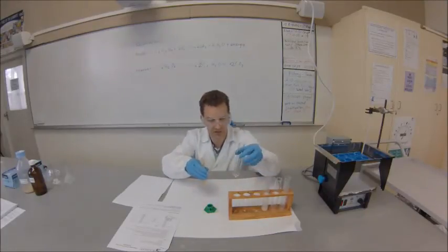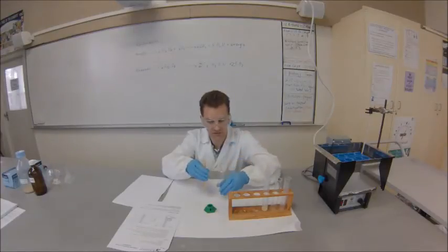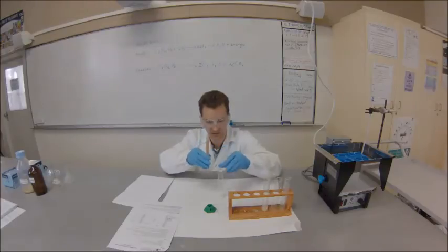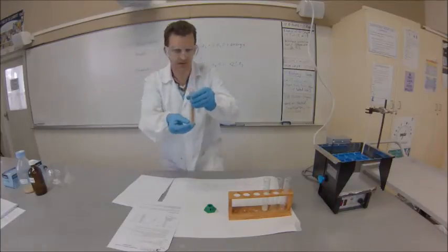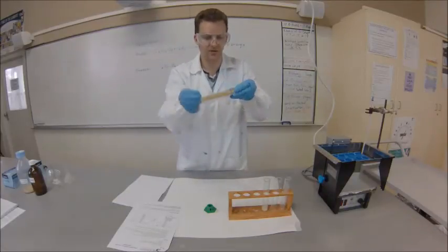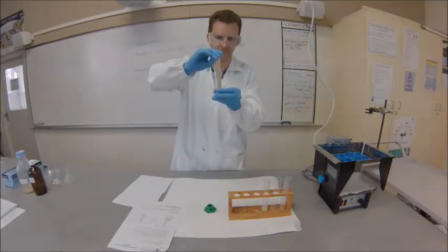Next, we're going to get a clean test tube and turn it upside down. We'll put the measuring cylinder inside the test tube - put it on top. Then hold the measuring cylinder as high as it will go and flip it over.